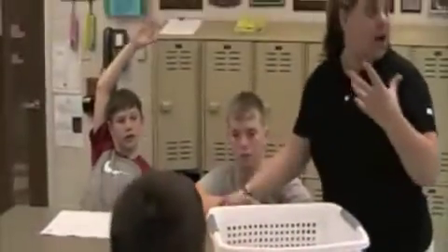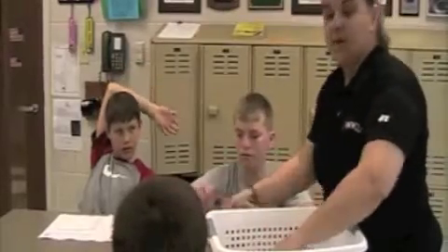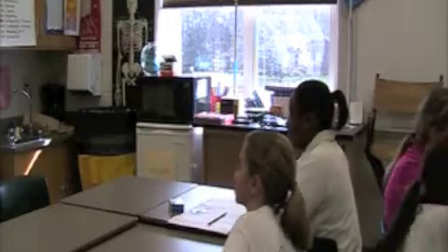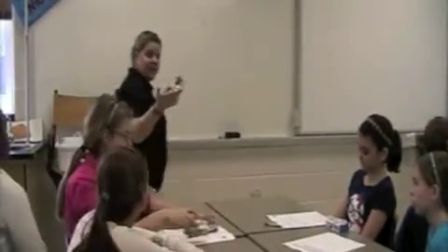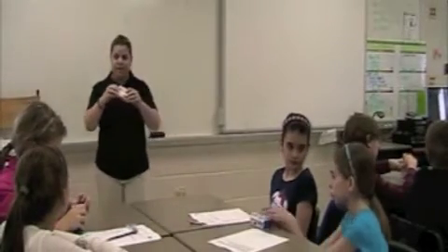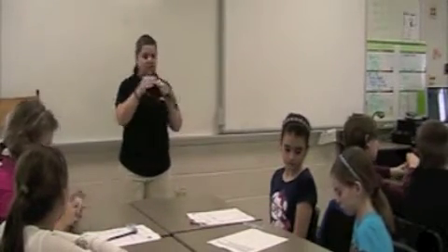Something that you can put an object under and you can see closer to it. Okay, so something that's used to see an object up close. A piece of equipment, right? If you can put something under it, you can observe it. So who uses microscopes? Scientists. Are you all scientists today? Yes. So take your microscope out of the box, and before I give you the evidence we're going to examine, let's make sure we know what to do with our microscope.